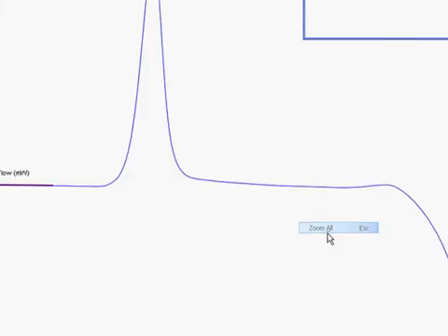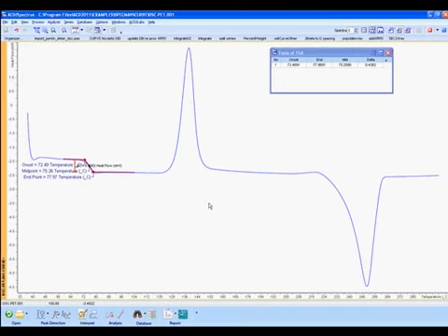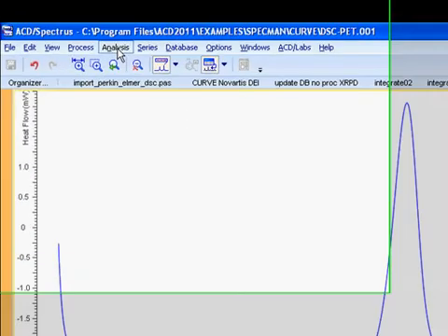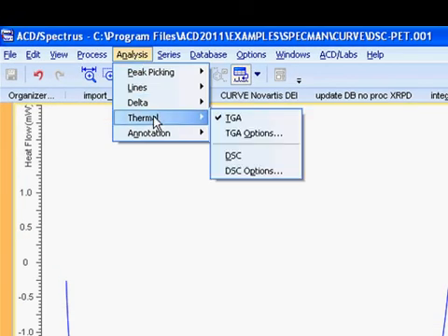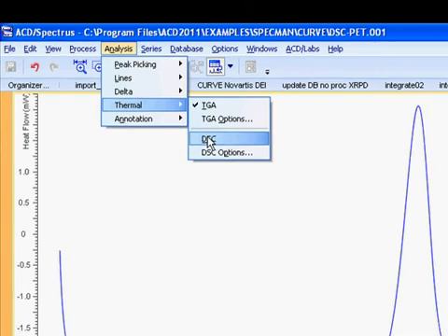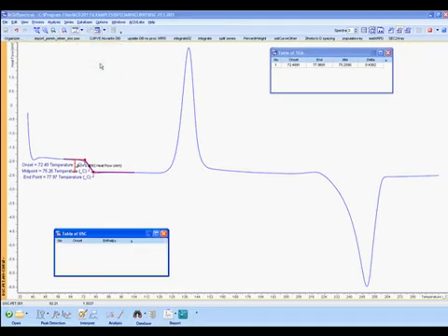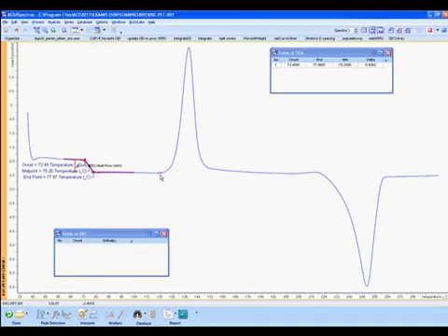We can access differential scanning calorimetry tools in a similar fashion: Analyze, Thermal, DSC from the top menu. In DSC mode, we simply select two points to create the baseline, and the software will determine and label onset and enthalpy.